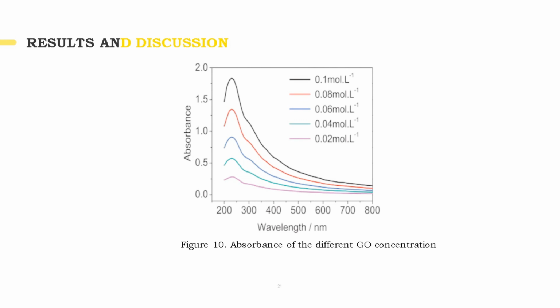The thickness of triple layer graphene sheets was 1.8 nanometers when the C/O ratio was 2 to 2.6. These results show that the thickness of graphene sheets depends on the content of oxygen-containing groups in the sample.